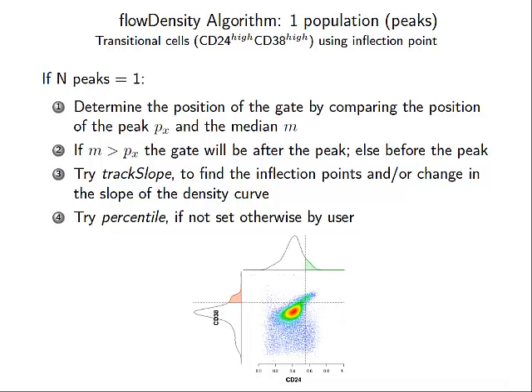With Suzanne's question, what is a cell population? I'm talking this afternoon about ontologies and trying to define what these things are. I can put it this way: is there a bunch of dots that you want to find, and would you put those dots into a different box than these other dots? If you think those dots should be counted separately from these other dots, how would you decide those dots go in group one versus those dots go in group two? And if looking at the change of slope works for you, then if that change of slope is going to be in the training set and it's in the test set, then that's good enough for me, and hopefully things don't change from now on. If you decide that you want to put those dots into a different group, then we have to find a better way to get those dots into a different group.